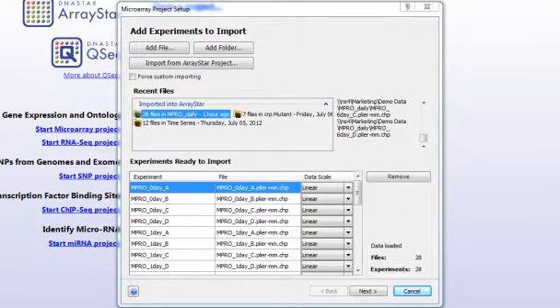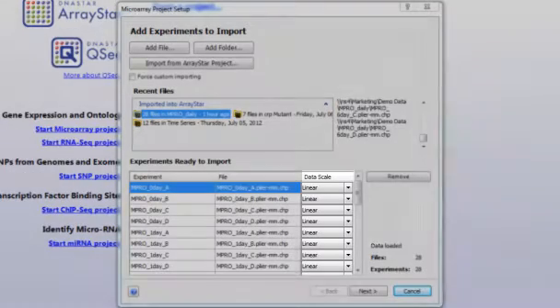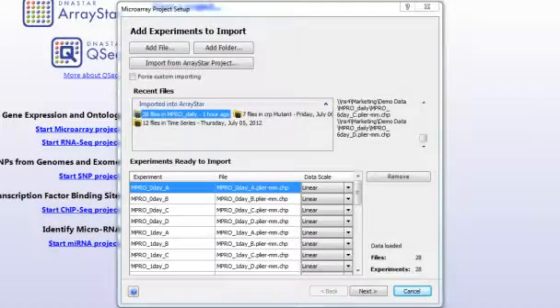After loading your files, ArrayStar automatically attempts to detect the data scale of each imported array. By clicking the drop-down arrow in the Data Scale column, you can change the data scale for individual or multiple experiments between the Linear, Log2, and Log10 options. In cases where the data scale is certain, as with cell and chip files, the ability to change this field is disabled.